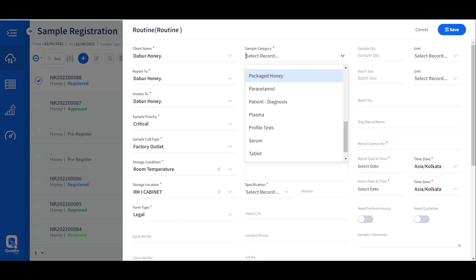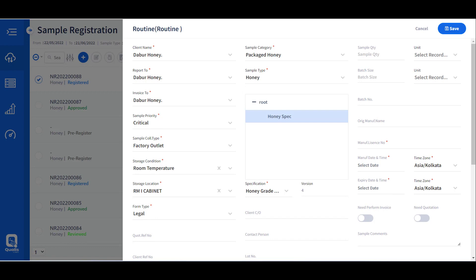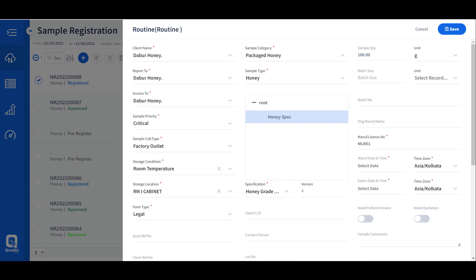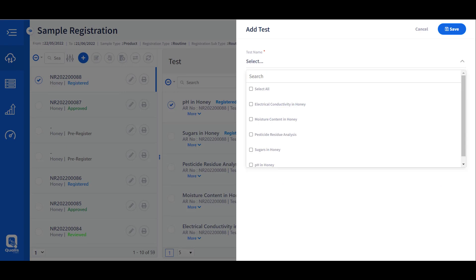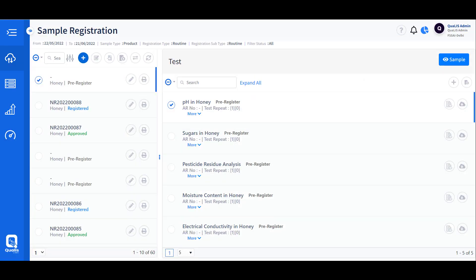Once we select the appropriate sample, the approved list of specifications is displayed automatically. We can choose the respective specification to analyze the sample, provide other pieces of information as needed for the sample properties, and then choose the tests associated with the respective selected sample. Once the tests are chosen, the sample can be pre-registered, meaning it is not yet assigned a unique identifier and can still be edited.